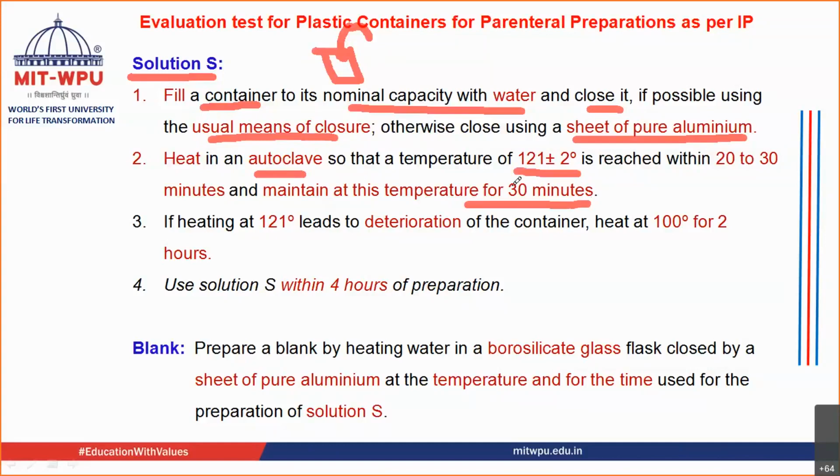You increase the temperature to 121 within 20 to 30 minutes, and you maintain the temperature for the next 30 minutes.